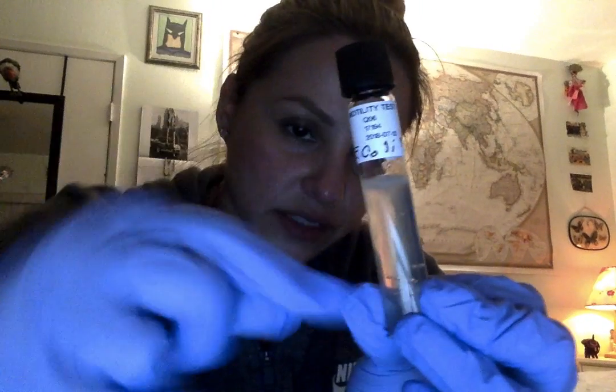Actually the S. epidermis was not motile, so it tested negative for motility. And the E. coli tested positive. This is actually a little bit easier to see. See how it's kind of all cloudiness. The stab went, I think, in this direction, and it kind of spread. But again, this has been sitting for a while. Those were my results. So E. coli was positive for motility, S. epidermis negative for motility.